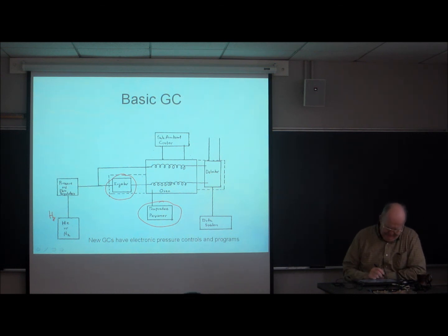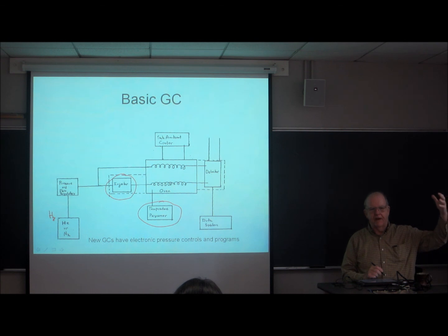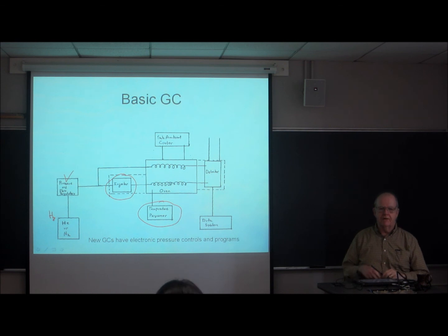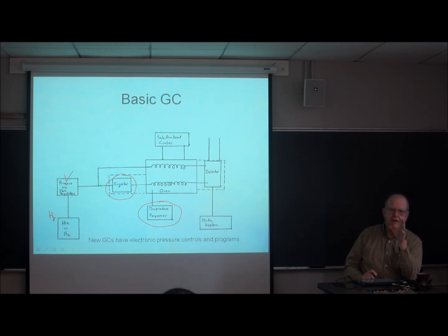lower. The kinds of pressure regulators that exist right on top of the tank are just not adequate to maintain the pressure properly. So there's always, between the tank and the rest of the chromatograph, a system of delicate pressure regulators that can really hold it quite constant, and also flow controllers.